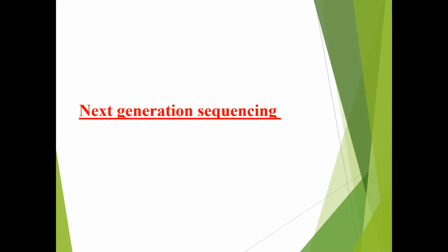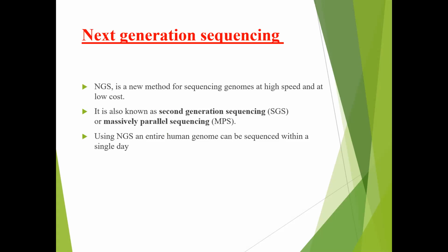Then we also have next generation sequencing. What is this next generation sequencing? Whatever technique or improvement that is developed for DNA sequencing after automated DNA sequencing is called next generation sequencing. Any improvement that happened after automated DNA sequencing is named as next generation sequencing.